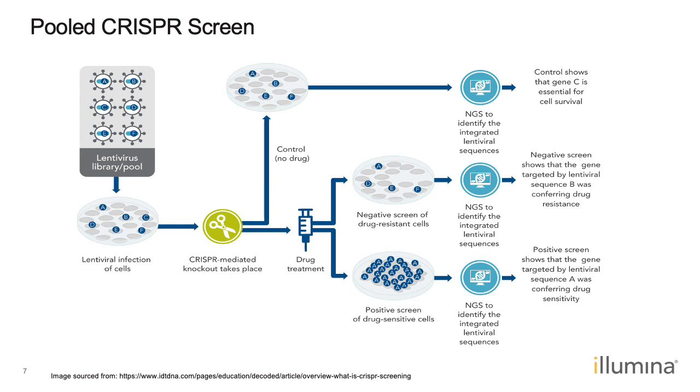And so what we do then is follow this up with Illumina sequencing to identify what particular guides may be present or absent from our population of cells. We are basically going to be counting these guides in the end to help identify previously unknown genes that contribute to a particular phenotype. For example, identifying genes conferring sensitivity to a particular drug or treatment.